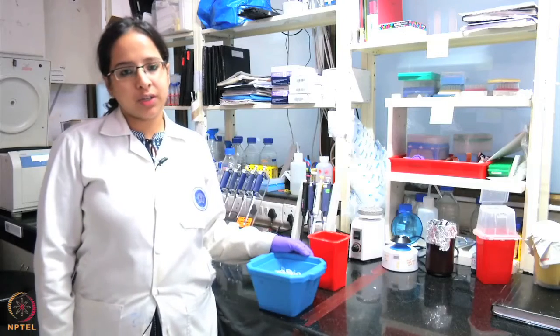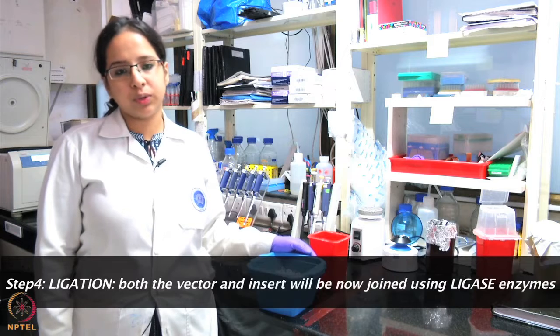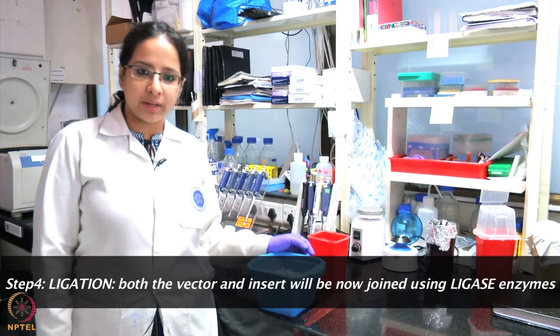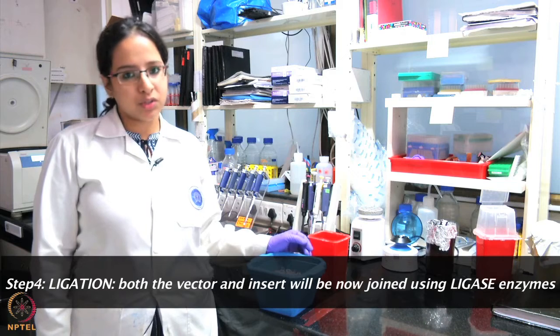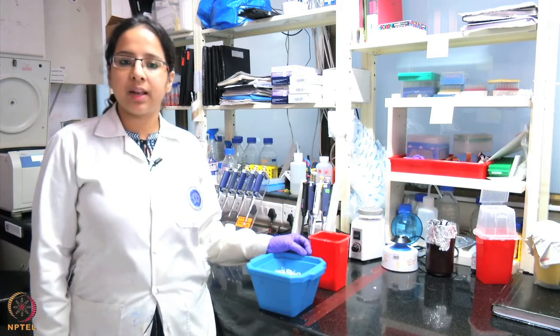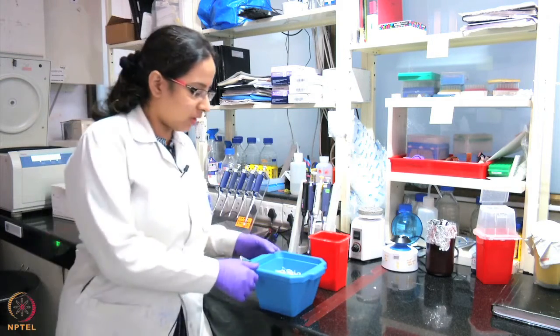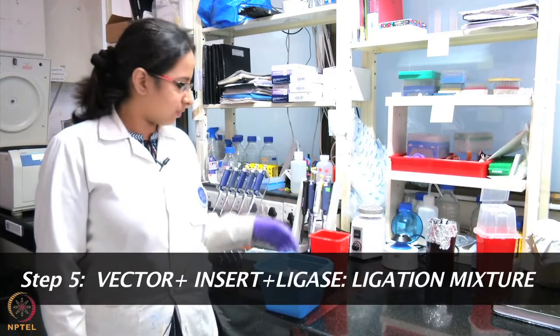After restriction digestion has been performed, the next step is ligation of the two DNAs. We have our vector DNA as well as the insert DNA, which has been cleaved by the restriction enzyme. Now we'll join the two compatible ends using the ligase enzyme. Here we have all the components of the reaction.